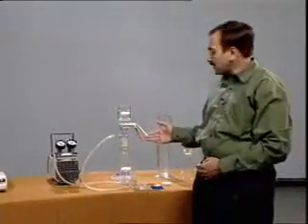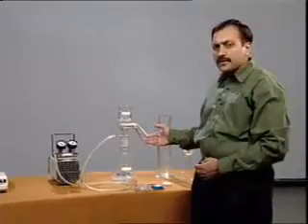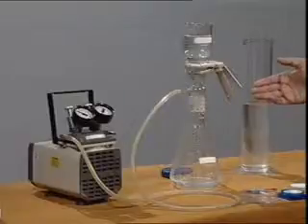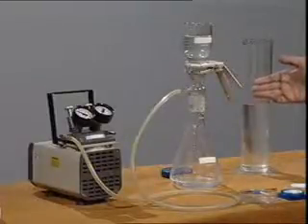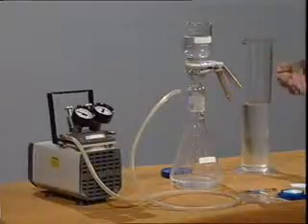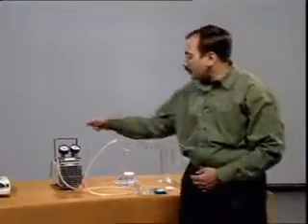As the process continues, it may be possible that the filtration gets slower because of absorption of suspended impurities over the filter. So, we can increase the rate of filtration by applying more suction.